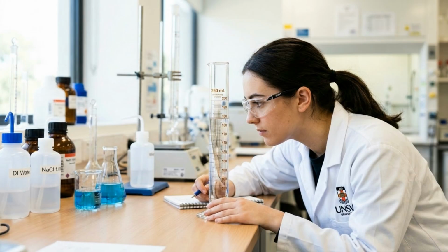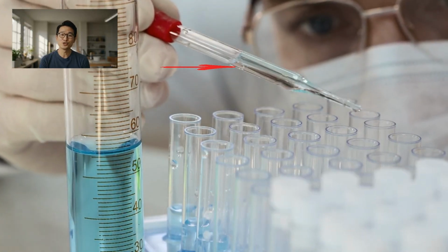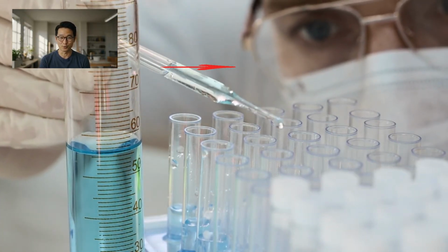This is a measuring cylinder. It is used to measure volumes of liquids. It comes in a variety of sizes. If you want to measure the volume of a liquid, you need to always read at eye level, from the bottom of the meniscus. This is a dropping pipette. It is used to transfer and dispense small volumes of liquid.